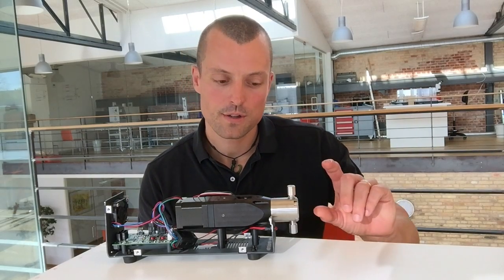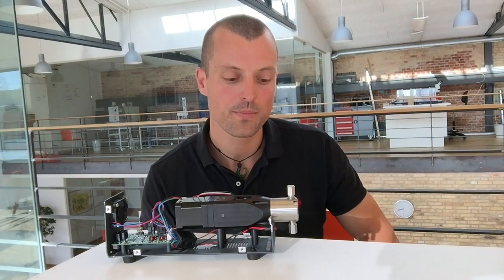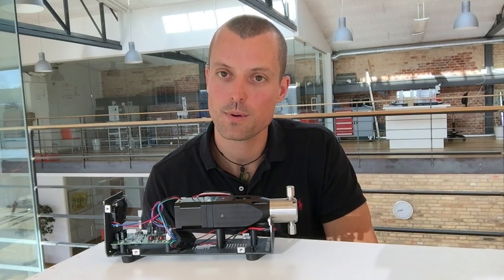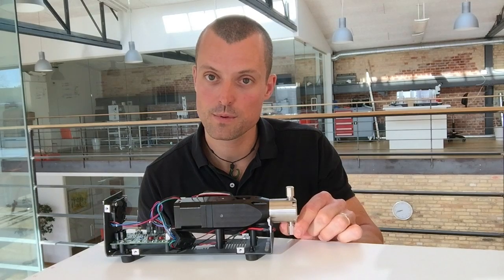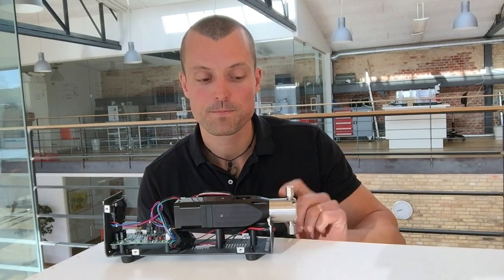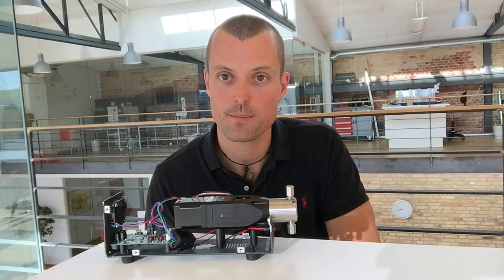First and foremost, we have removed the check valves that come with the pumps as default. On the high-pressure pump, we have replaced these with 1/16th of an inch industry standard ports. And for the low-pressure pump, we have completely removed the bottom port and only have a port at the top of the pump head, which would be a quarter-inch industry standard flat bottom port.